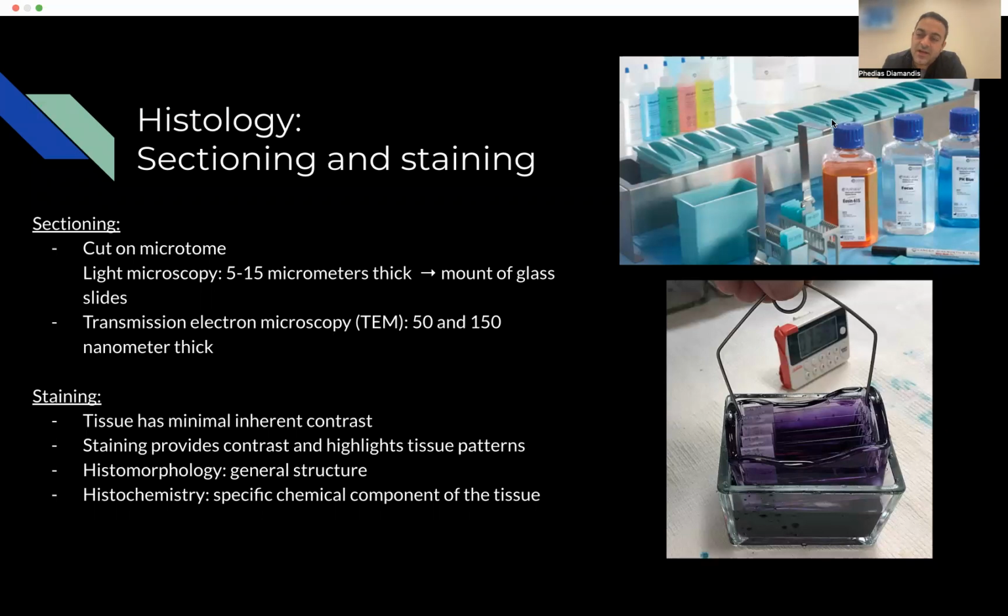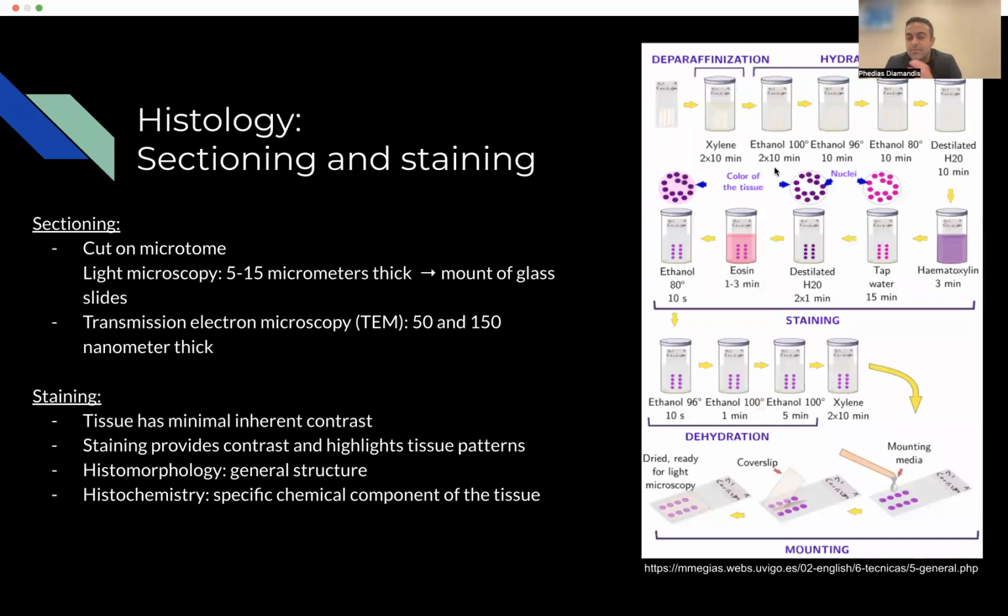So why are there so many of these buckets? The problem is that the slide is inherently hydrophobic. The tissue is embedded in wax, and the stains are hydrophilic. They're aqueous based stains. So we need to transition the tissue that was originally aqueous, that we had to dehydrate to put into wax. Now we have to take it back into an aqueous solution. So the first step is called deparaffinization.